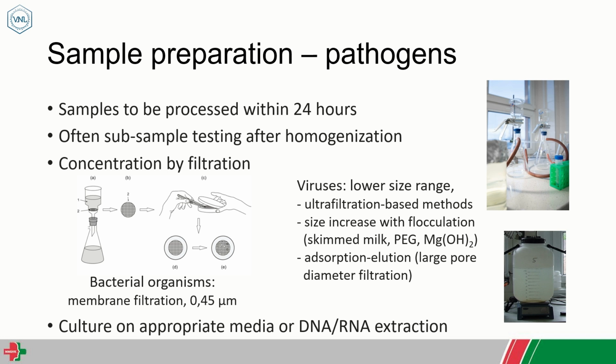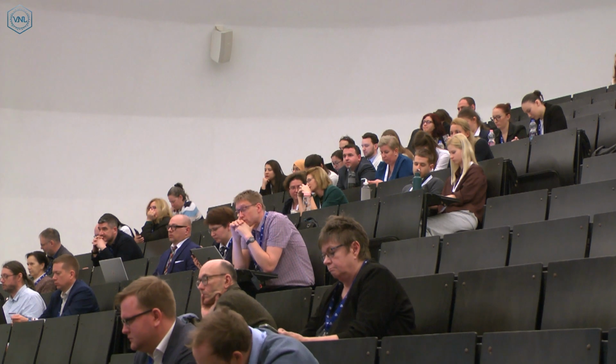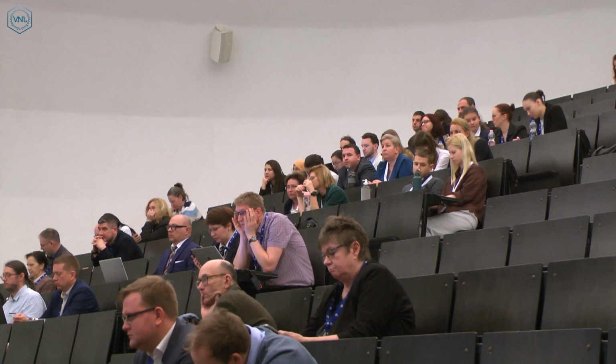And then we can do the analysis by culturing on media or by extraction of DNA or RNA.